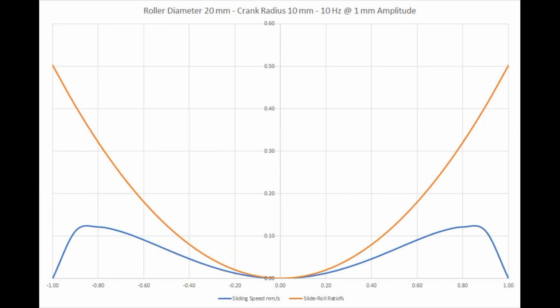Reducing the stroke to 2mm generates a contact with microslip, resulting in a model of the kind of fretting motion observed in bearings.